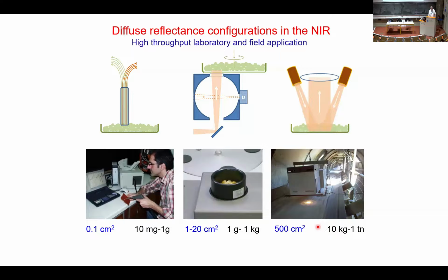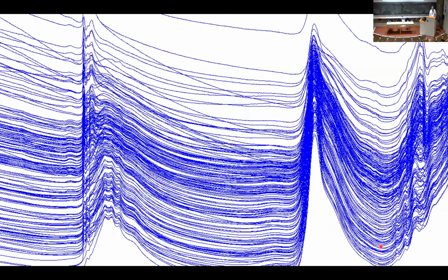And you collect spectra, and you collect them very reliably and reproducibly, but they're quite different from each other, and they look like this. Your screen will look like this at the end of the day. These are about 200 something spectra. I cut the x-axis, doesn't matter. This is near infrared, but that's how they look. There's a lot of information there, but we should do something in order to extract it, because there's a lot of irrelevant stuff there.